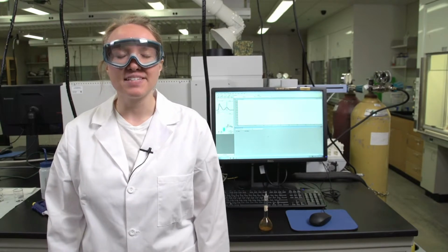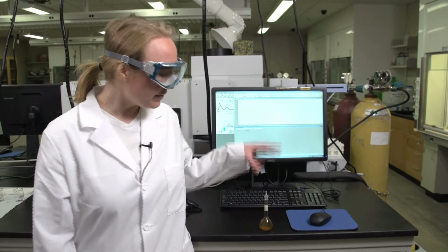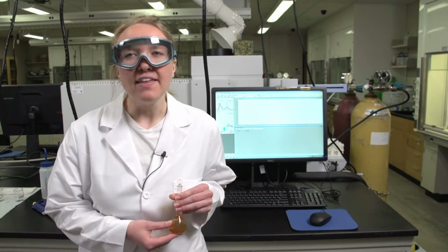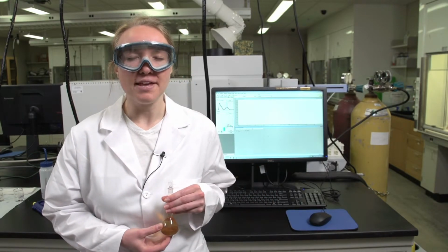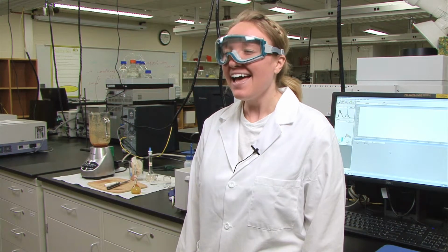In the second part of this experiment, you'll need to choose an inhibitor and then prepare 50 milliliters of that solution, and then use the same type of apple that you used on day 1 to prepare the enzyme catecholase solution. Collect the blank, and then collect kinetic data using the volume of substrate over the center of the linear portion of the Lineweaver-Burk plot.